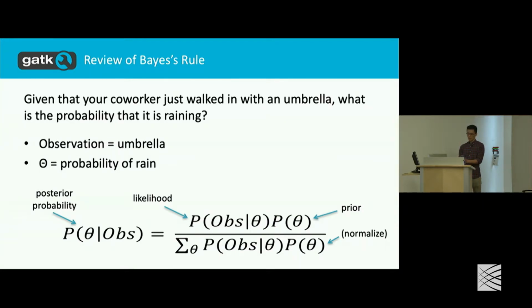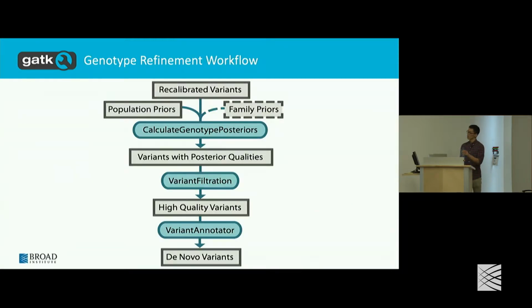But then you happen to have a sample where you see this mutation. It could be real, but more likely it is just some sort of sequencing artifact. So you can leverage the information from the population, an orthogonal data set, to update your genotype quality.